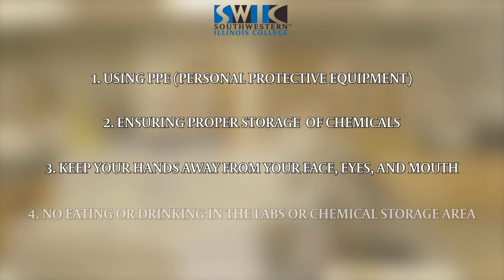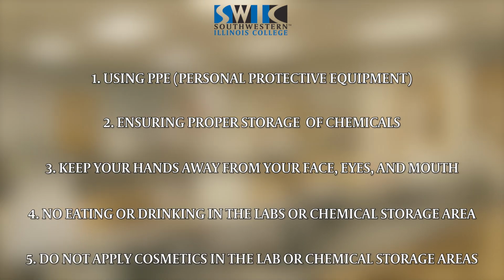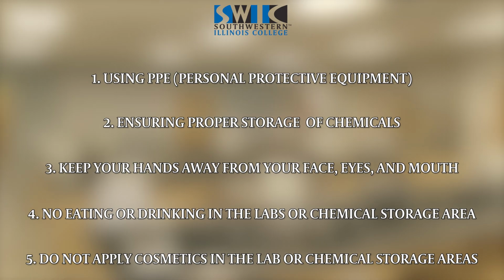It's also hazardous to eat or drink in the lab or chemical storage area. Be sure not to apply cosmetics in the lab areas either. Follow these safety tips, and you'll minimize risk.